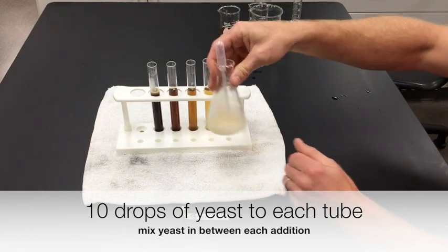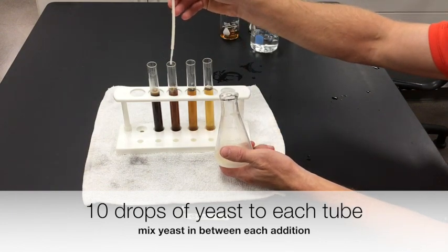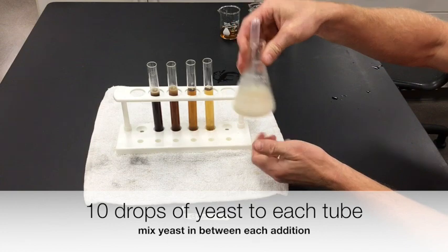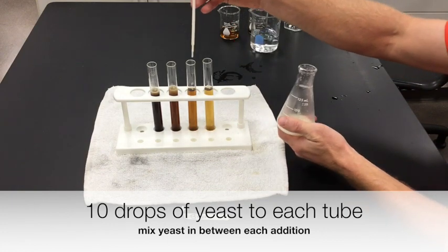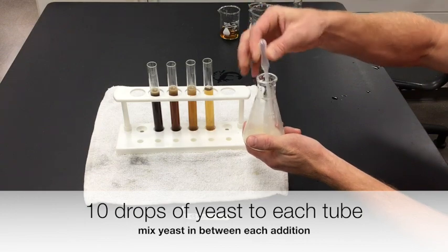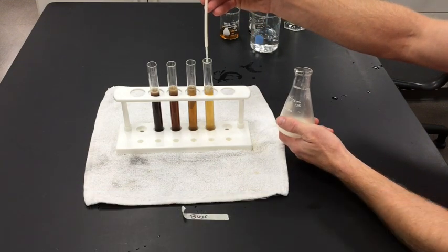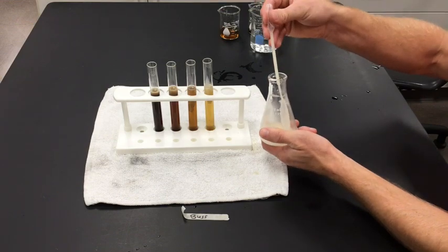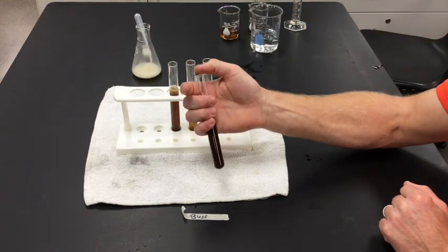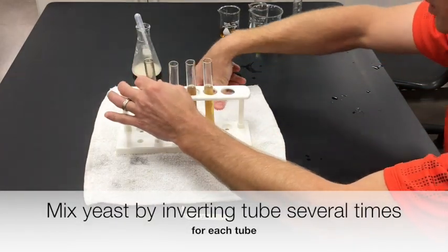Put the rest back in the Erlenmeyer flask, swirl again, pull up more yeast, and add 10 drops to the next one. Put the rest back, swirl it again, pull up some more — 10 drops to the next. Put the rest in, swirl it one last time, pull up the yeast, and add 10 drops to the last tube. Now mix each of these by capping the top with my thumb and inverting it a couple times, dabbing my thumb on the towel in between each one.